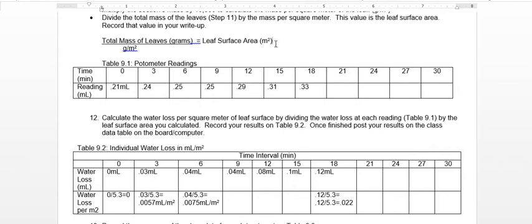The amount of water loss is very unique per plant, but I felt like most groups were having water loss from beginning 0 to the end at 21 minutes of like 0.20 milliliters at most being lost in total. Your story is your story. Your lab is your lab, and my species of plant was different than your species of plant, and the scale. Y'all's potometer setup could perhaps be smaller than mine. In the end, the data is the data. It's more about the relationship that's important.